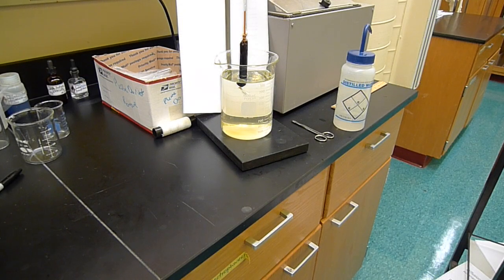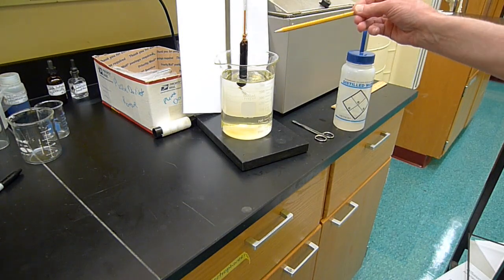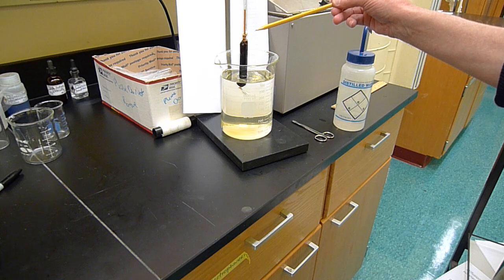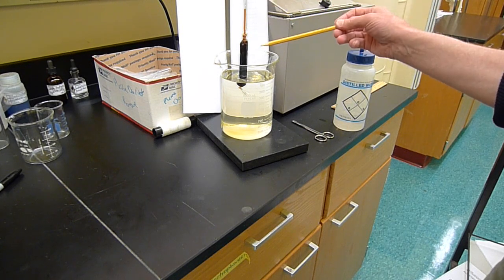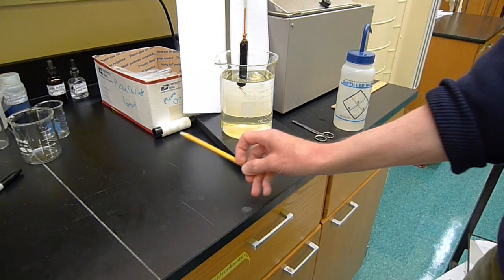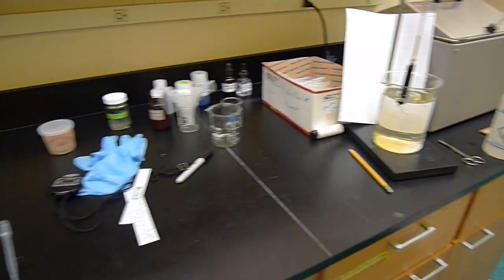So in this apparatus, I've got yet another piece of dialysis tubing tied into a bag, and then I tied it onto the end of this glass tubing here. Same kind of dialysis tubing, and then I filled it full of molasses. And the molasses is basically a sugar syrup. So this is a demonstration of osmosis. Let me give you a little blurb on what osmosis is.